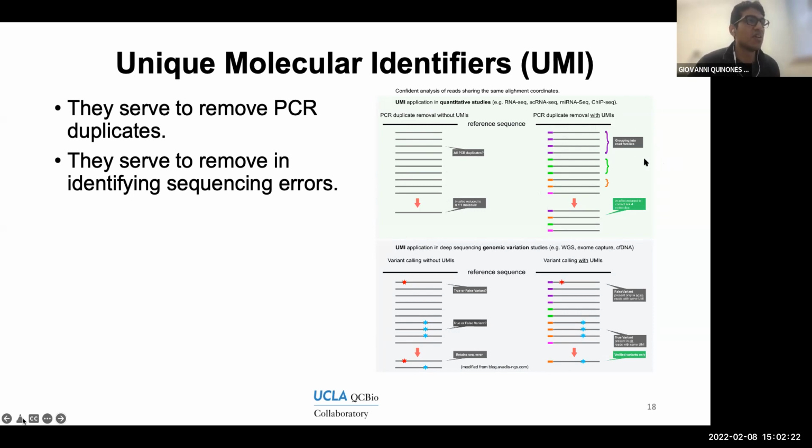If we look at the identifiers of the reads, there are four different colors, four different identifiers, which means these reads must have come from four different molecules. So it makes more sense to recover 4 reads rather than just one. And 4 versus 1 is also going to affect your final gene expression values, because you're getting a more accurate count.